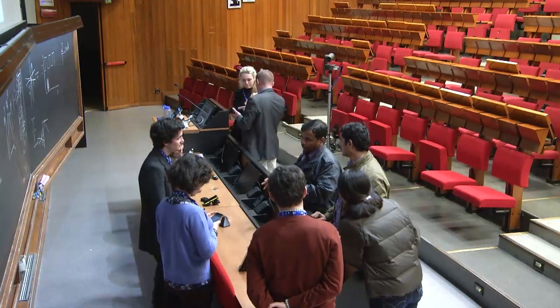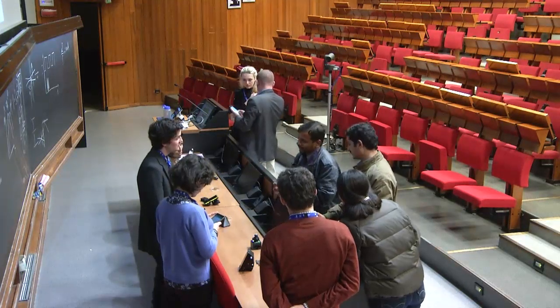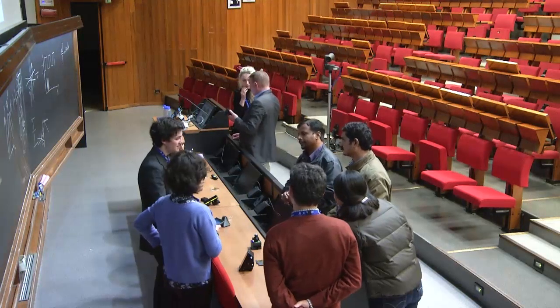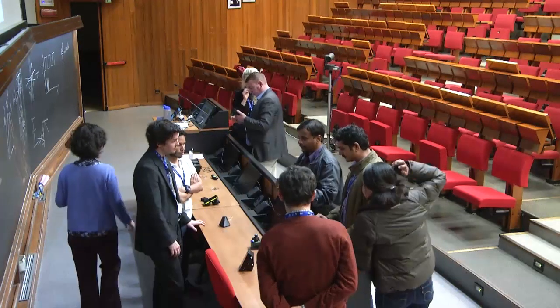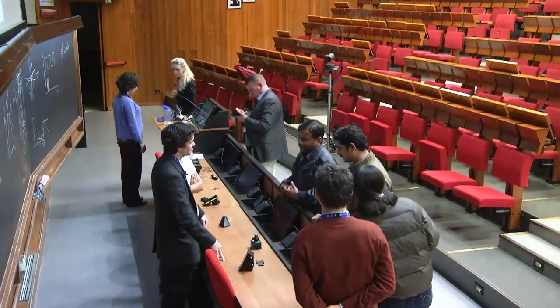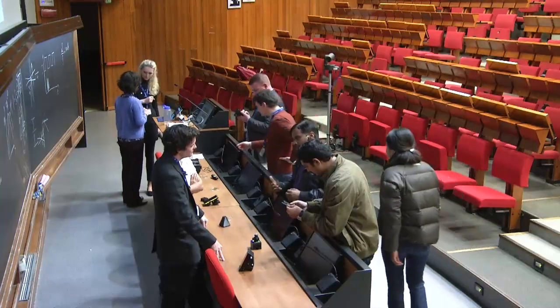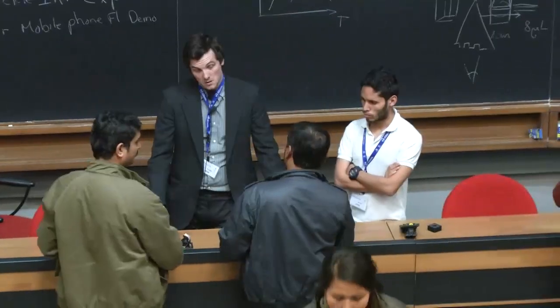I have made a small... for the students to... The way to do it is to go that route, to find technology that exists and that's cheap because it exists in mass. And so that's why I'm just asking whether this smartphone camera perhaps can track that particle. That is what I just wondered.